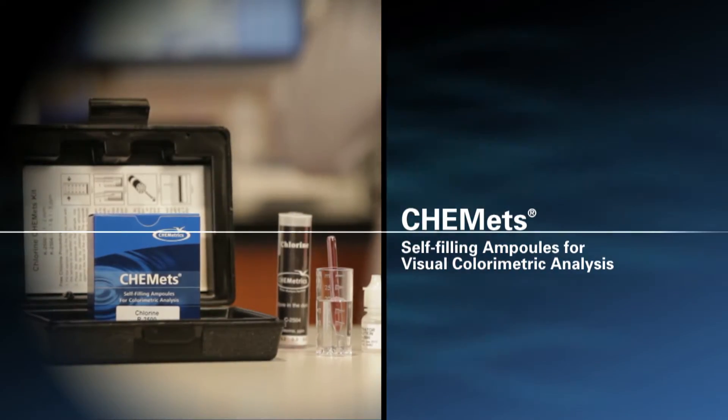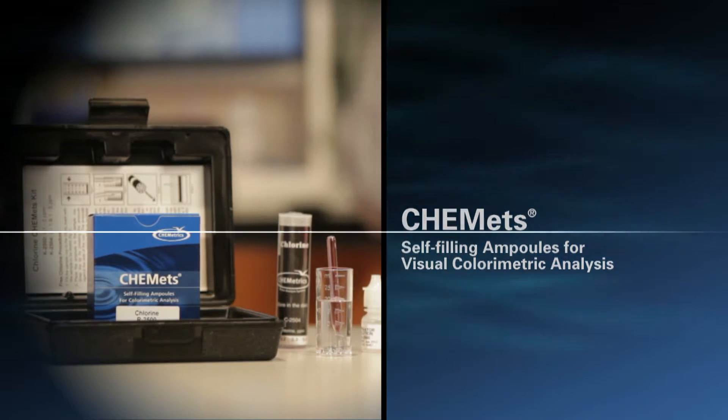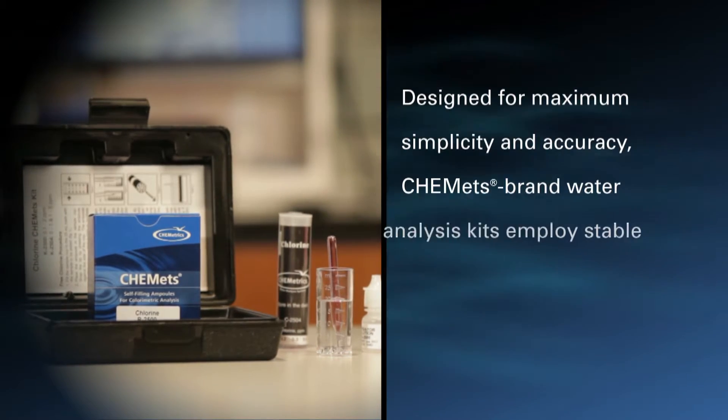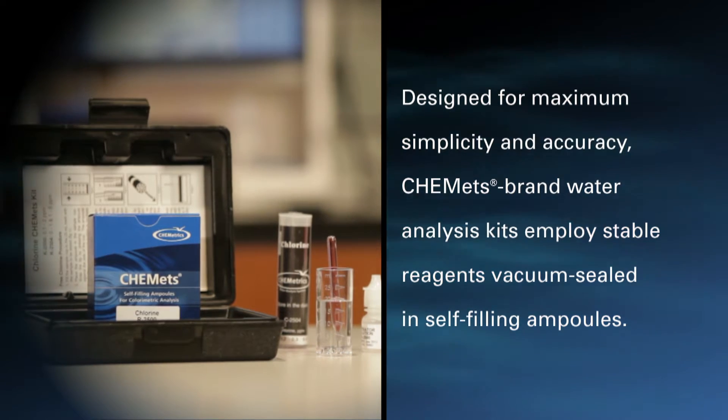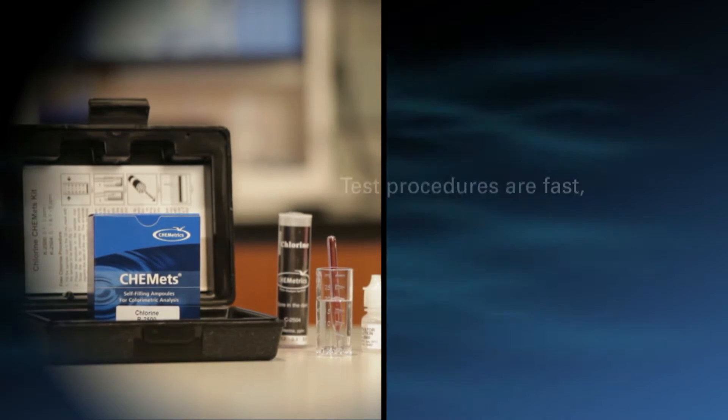CHEMets Self-Filling Ampules for Visual Colorimetric Analysis. Designed for maximum simplicity and accuracy, CHEMets brand water analysis kits employ stable reagents vacuum-sealed in self-filling ampules.